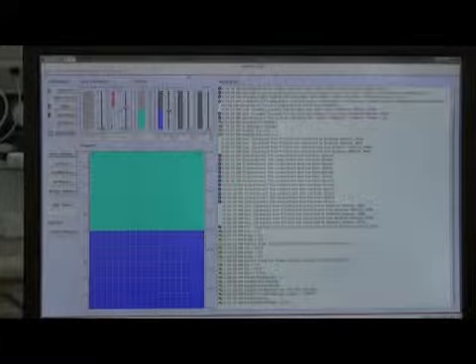In the auto sampler, you have one more option. I told you this tray works as a refrigerator. So this is the temperature control for the auto sampler. This is the temperature control. I make it on. You can make it on or off from here. Okay. I make it on and I give 5 degrees centigrade and I make it okay.